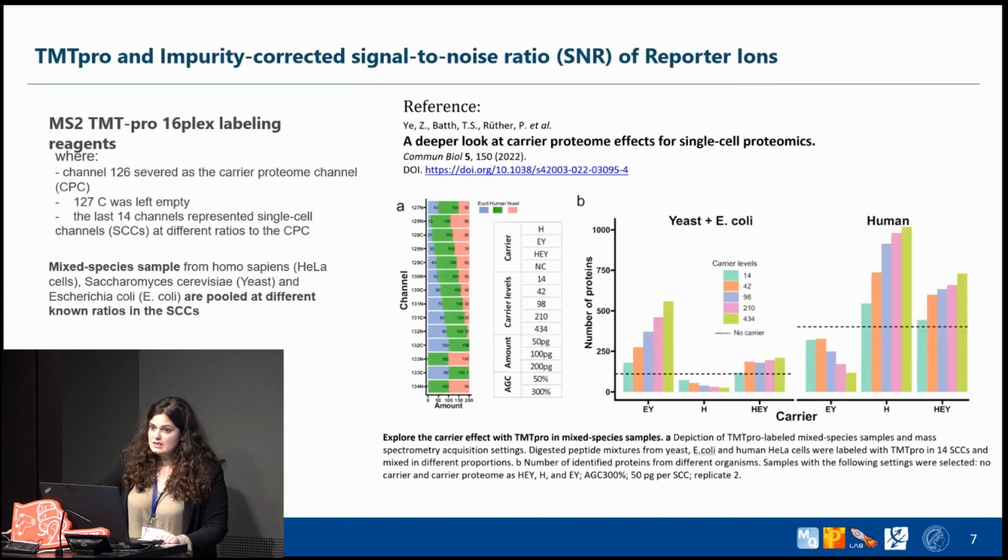It means that we need to take this into account when we process this data in MaxQuant. It is something that was also introduced last Tuesday during the MaxQuant tutorial, but I will show you once again how to do that when you have several species in the same data set, because there are these different ratios.